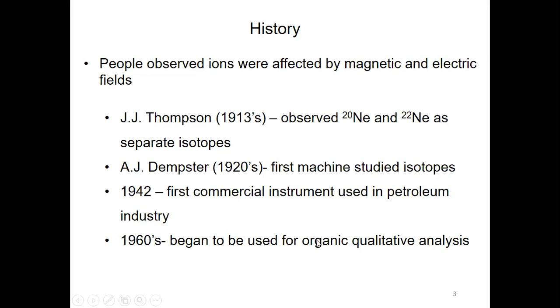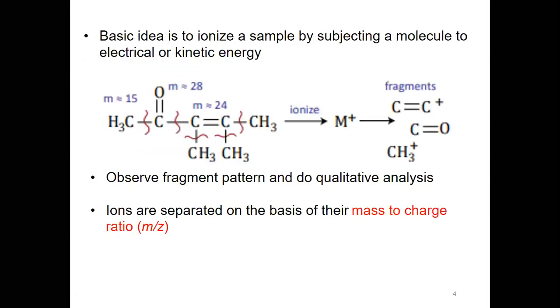Now we mostly use this for organic qualitative analysis, right? Structural elucidation began in the 1960s. So in the 1960s, it began to be used for organic qualitative analysis, not quantitative, qualitative analysis, like structural elucidation. Okay.